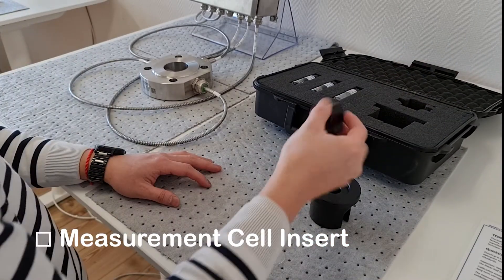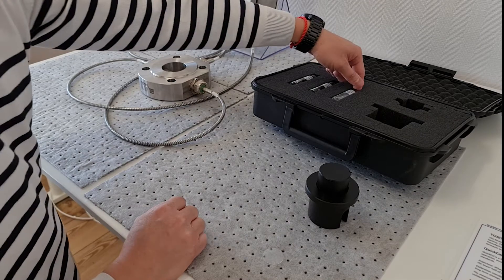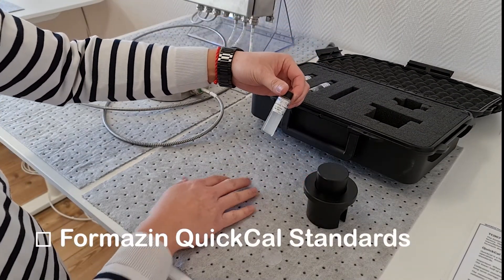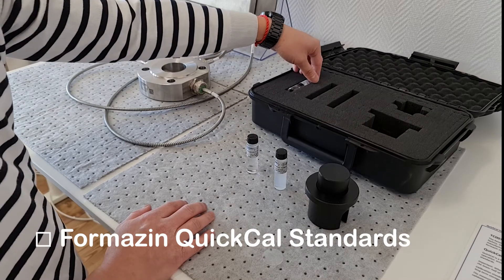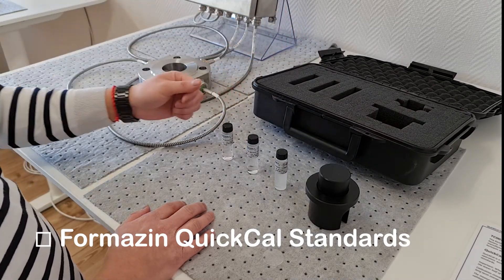A lid is used to prevent external light from interfering with the calibration. The calibration kit will contain three sealed vials of Formazine calibration standard matched to the size and type of cell being calibrated. The concentration of Formazine in the vials is 20, 100, and 800 Formazine turbidity units, or FTU.